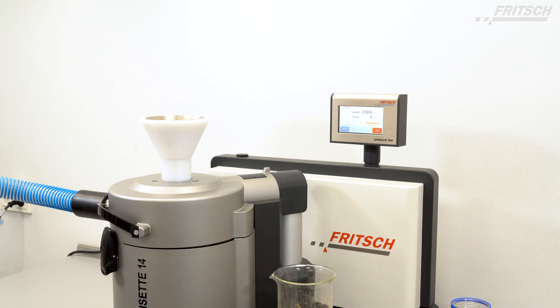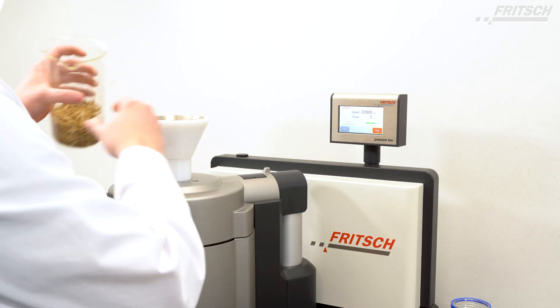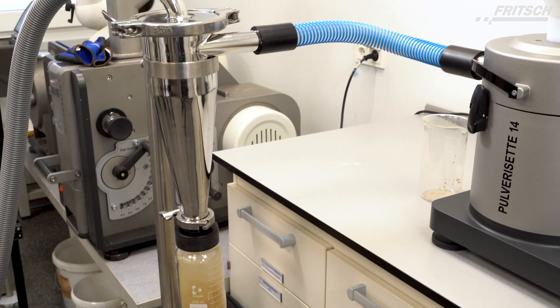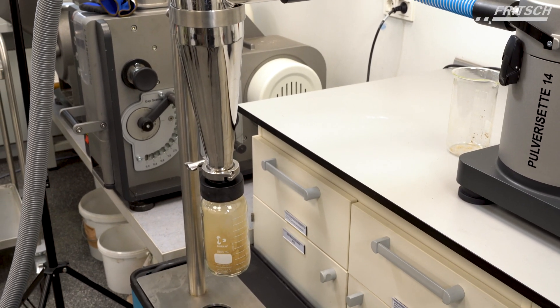Inside the variable speed rotor mill, the sample is comminuted by impacting against the ribs of the impact rotor, rotating at high speed, and also sheared between the rotor teeth and the inserted sieve ring.